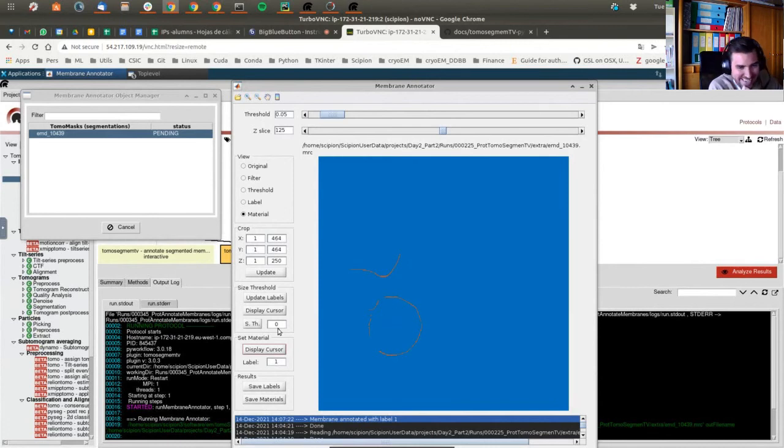I'm very sorry about the problems. Maybe I'm very used to using this tool, but I'm not familiar with this stack. I didn't find them when I prepared the documentation, but we'll work on it and solve it to provide you the best experience.